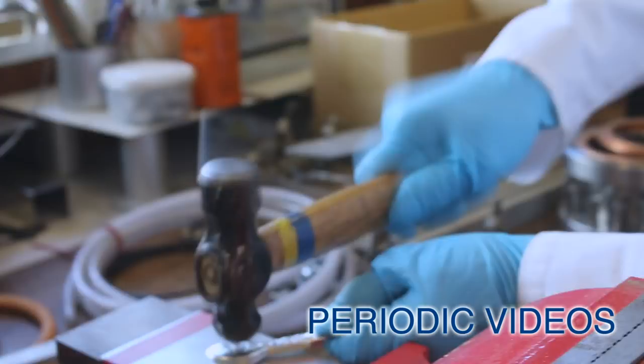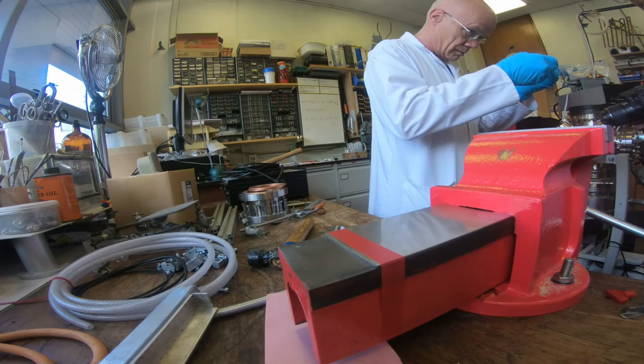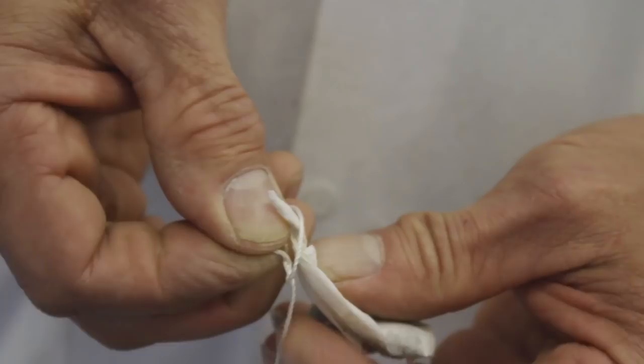Neil has finally done an experiment for me that I've really wanted to see for many, many years — a teaspoon dissolving or melting in a cup of tea. I thought that in joke shops you could buy a spoon like this that melted in tea. I've been to some of the leading magic shops in the UK and found nothing. And then a miracle happened.